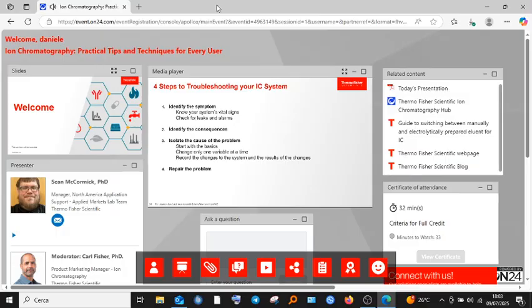The first step in troubleshooting your system is to identify the symptom. In order to identify symptoms, you need to know what normal is for your system, and that's what I refer to as system vitals. If you know your system vitals, you will know when something doesn't look right.